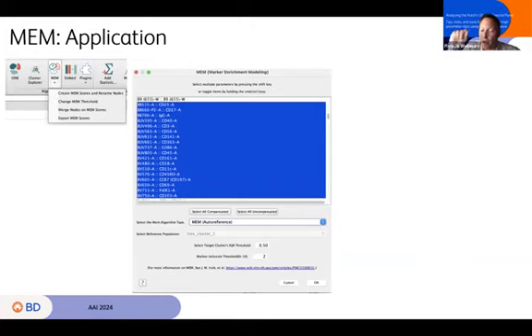In FlowJo, if you want to apply a MEM score and append that to your cluster names, so that you know what this cluster is, which parameters are driving the difference, you'll go to the algorithm band, click MEM. The first thing you have to do from these choices is create a MEM score. So you'll click that. You'll say which parameters are fair game to use. It's typically going to be all of them minus maybe some parameters used for cleanup. Live data is probably not interesting. If you made that one top level phenotype gate, okay, they're all positive for CD3 or whatever, cool, leave that out, but pretty much everything else.